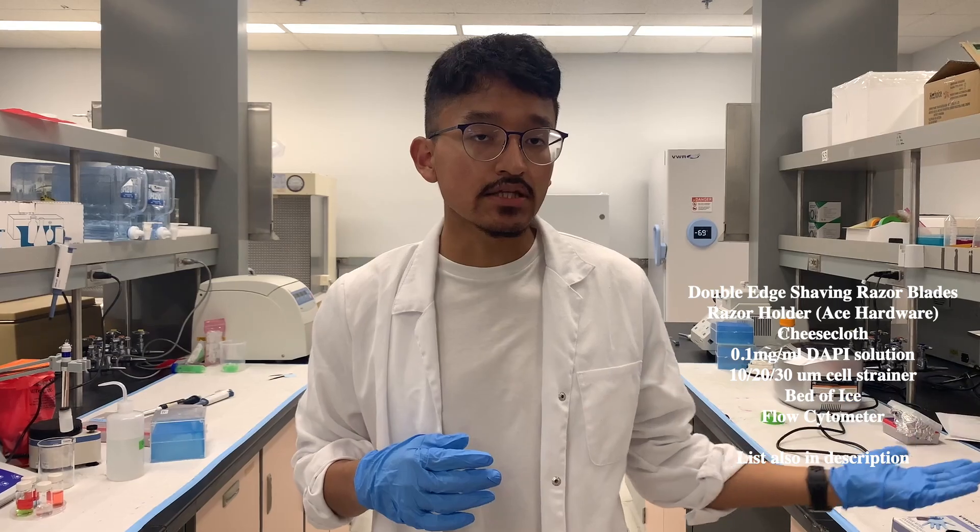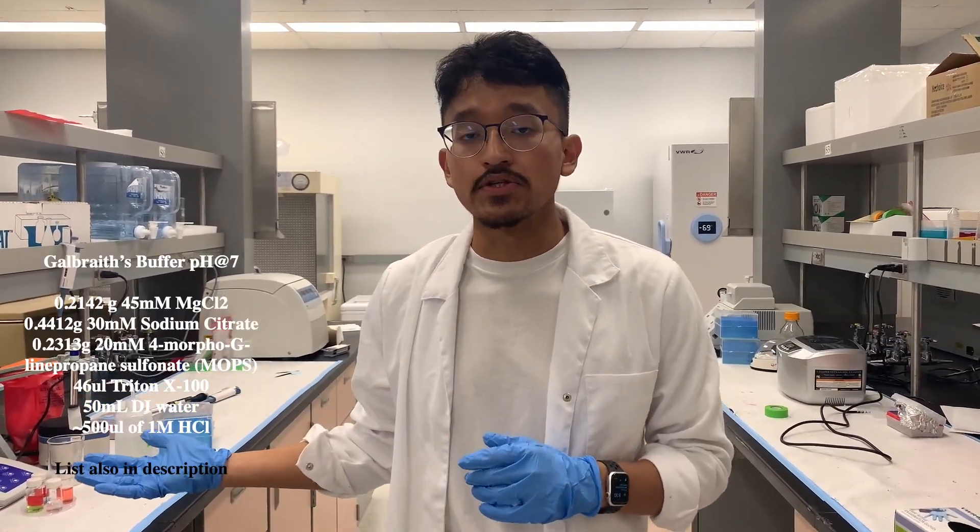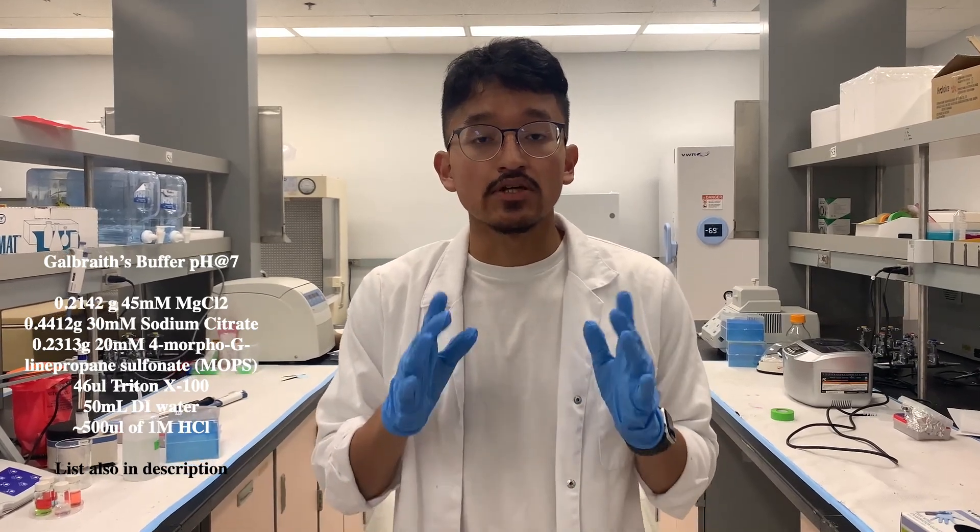You're going to need a couple things. You're going to need this and you will also need Galbraith's buffer. You can pause right now to see the ingredient list, and you also need cell strainers.